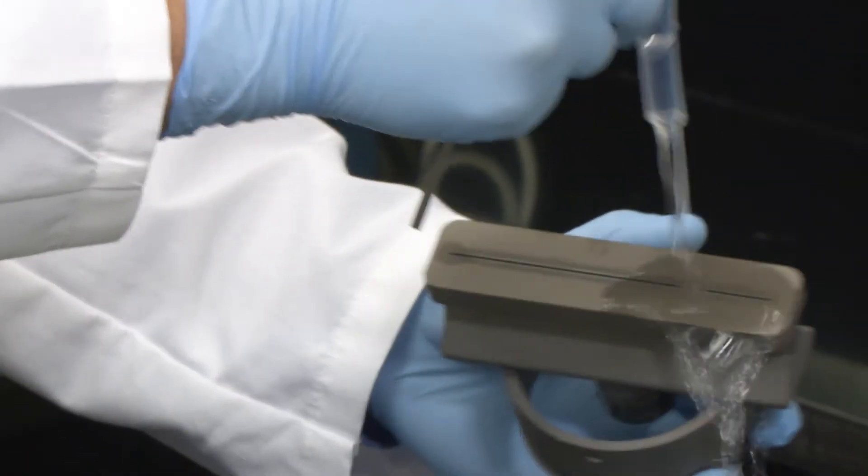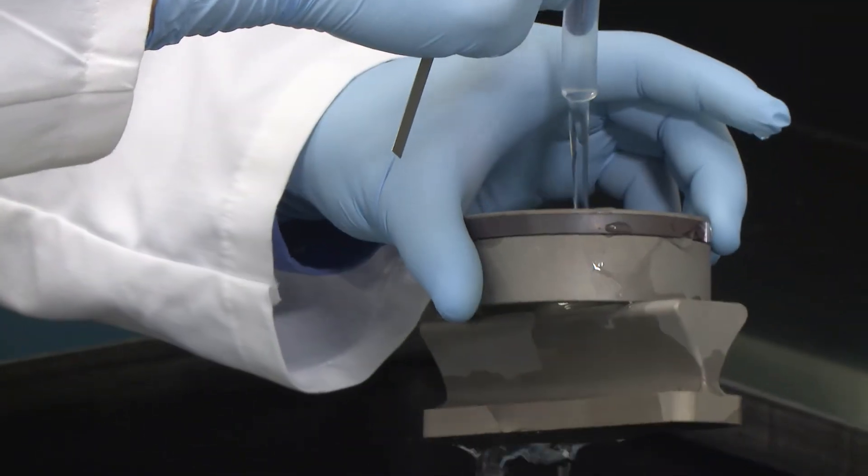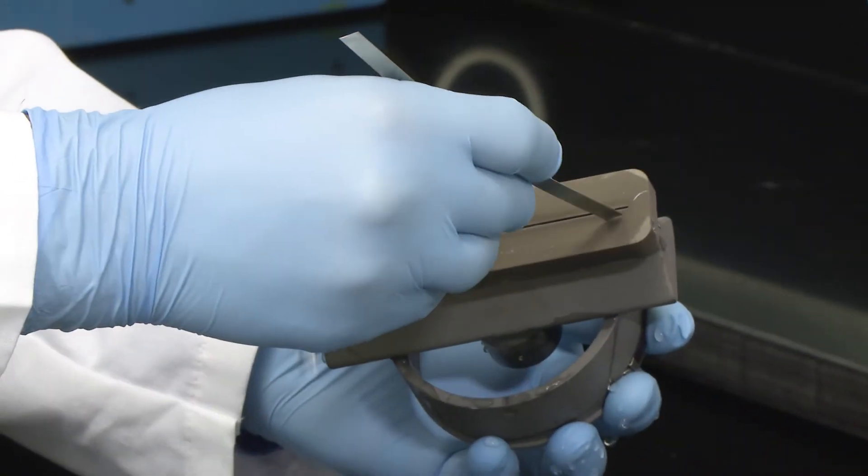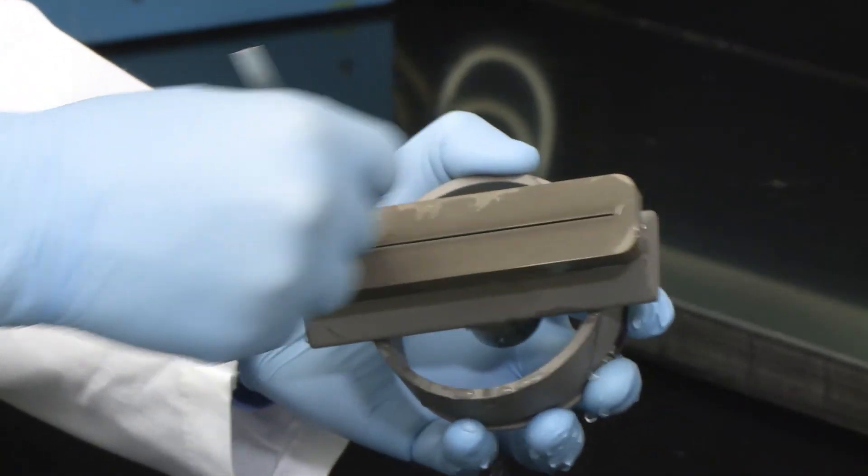After the burner head is cleaned, rinse the burner head well with deionized water and make sure that all scrapings are removed from inside and outside the burner head.